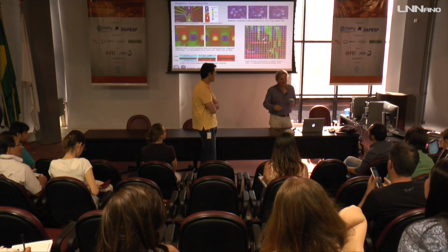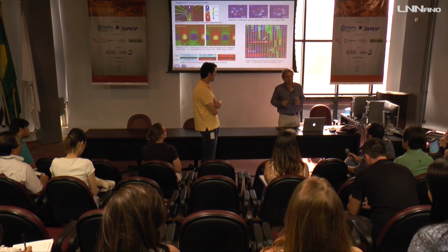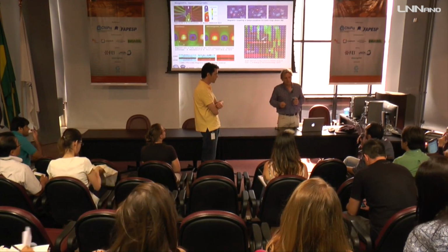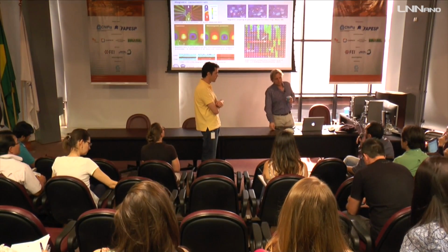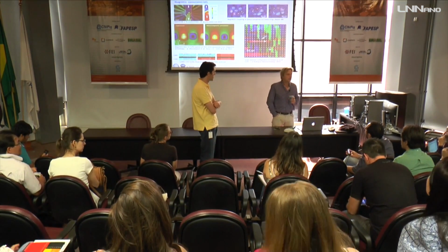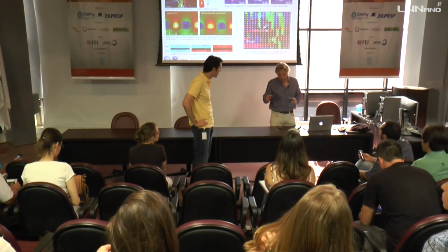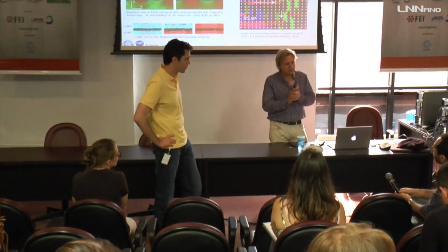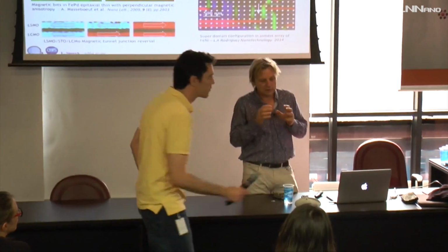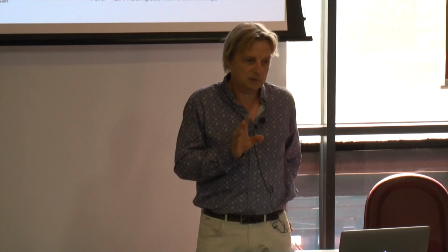No, for the present we didn't. You mean if we had some result that says no, this is not so evident? Something rare, something that the theory doesn't explain yet? Let me think. No, most of the time no. Actually, we are pushing the method to analyze in more and more detail smaller and smaller objects. Now we are reaching the point where, as I said, we have 5 angstrom resolution, so it starts to be very interesting.